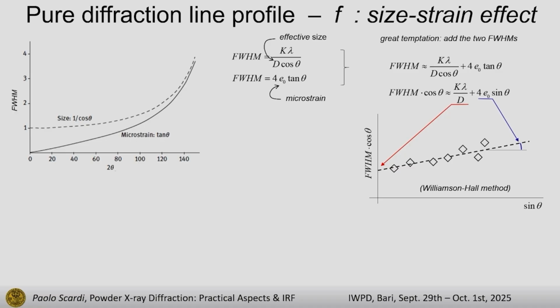I want just to stress 2 points. First of all, this exact assumption is used in most software, TOPAS included, when you use the default double Voigt approach, which I am going to show you in the next slide. That has been demonstrated by Roberts, and it's used not just in TOPAS, but nearly every other Rietveld software does more or less the same. So this equation is hidden. Now you are in the sausage factory. So you're looking at what is inside your code.